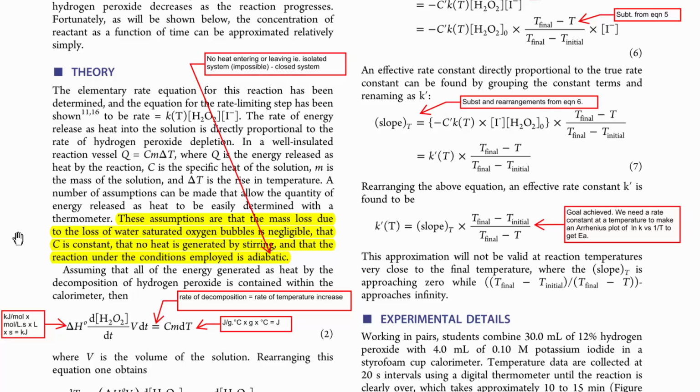Even while the experiment is going, the cooling is so dramatic that the temperature drops before the experiment has even finished. So there are massive errors in this, but I'm going on with it. I still think this is highly valuable, because that's just for this experiment. You could fix all that by using an experiment that does not give off gases. So that's the huge fault with this one, but everything else is quite good.